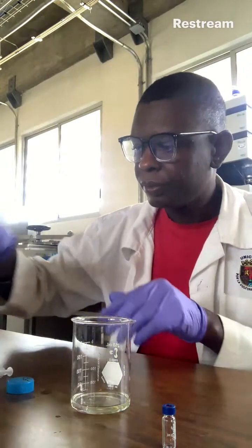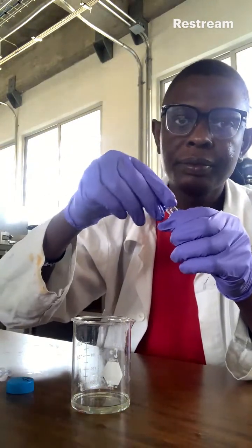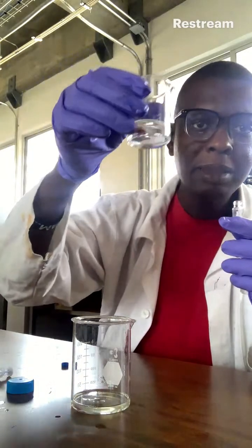Now, the last bottle is for my blank. This is for my blank. And I am using isopropanol as my blank.